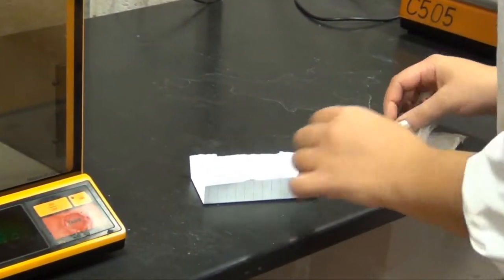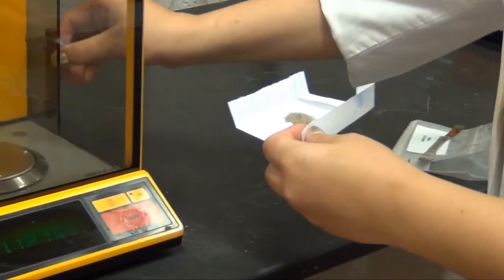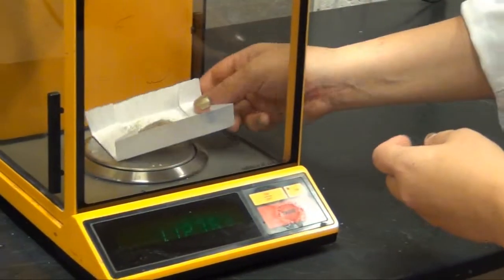None of these adjustments are made over the balance, because that would make further measurements inaccurate.